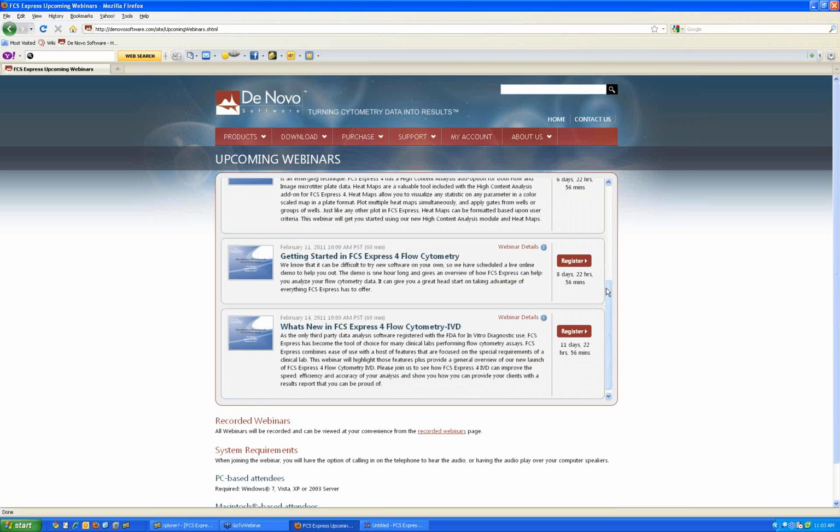A Getting Started session, which goes over not every single feature but goes into more detail, is on February 11th. The IVD one, for those IVD customers or clinical lab customers on the call, I'd highly suggest you check this one out. Tanya will go into a lot more detail about the IVD features.